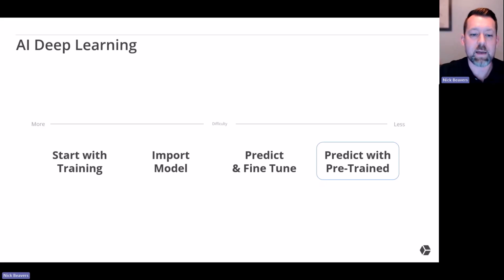And then even worse than that would be models that are openly available. They've seen images, maybe an object similar to what you're working with. There's maybe thousands of different versions of them. They're constantly changing. They're on many different websites, and there's all these model zoos out there. They're fantastic, and we have nothing but positive things to say about how the community is working toward incredible new ways of working with AI deep learning. But for your lab, if you'd like to be efficient, working with the model zoos, if you really know what you're doing and you have someone highly trained in that, they could possibly be efficient. But what's the most efficient is to have a model that already has seen something similar to your types of images and to use that as a starting point.